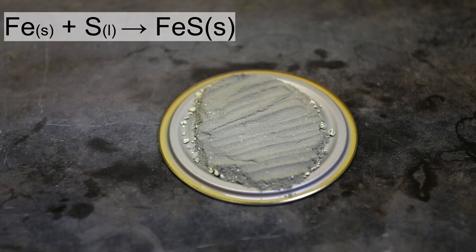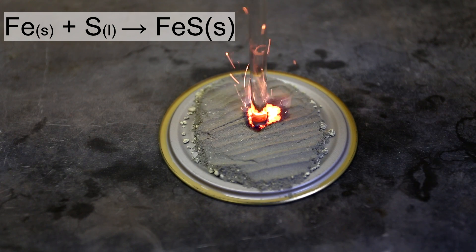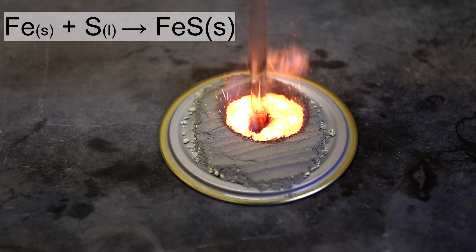The reaction that's going on here is actually quite simple. Simply put, the solid iron and the liquid sulfur combine to form iron(II) sulfide in an extremely exothermic reaction.